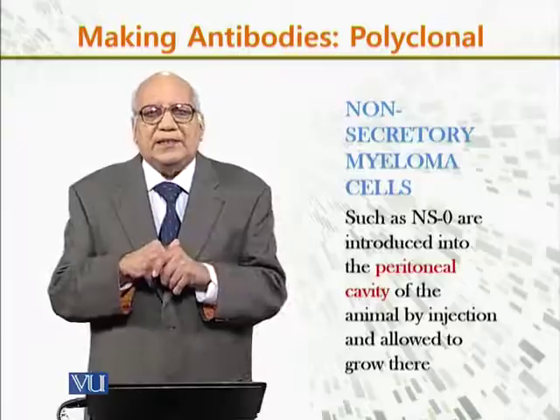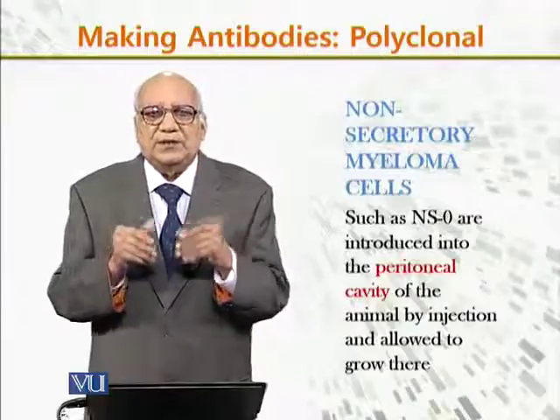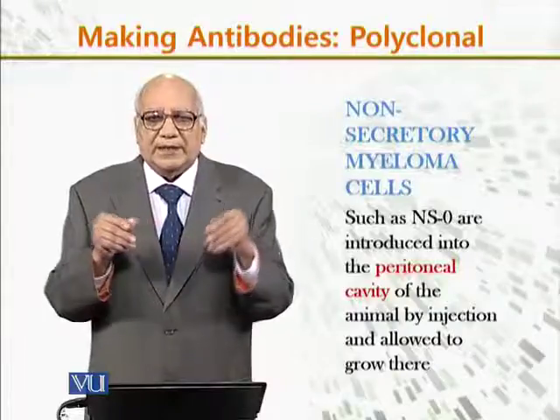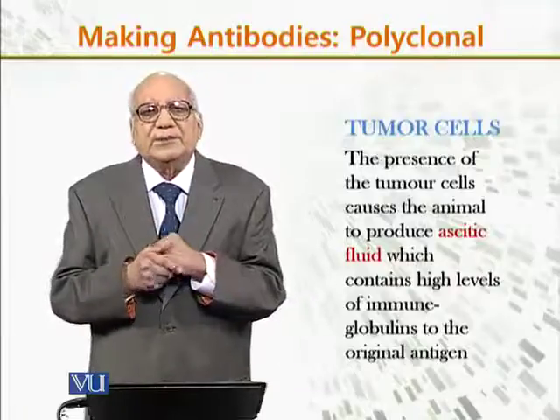Now, non-secretory myeloma cells, such as NS0, are introduced into the peritoneal cavity of the animal by injection and allowed to grow there, and they make tumor cells.